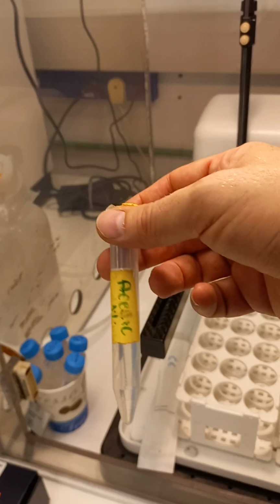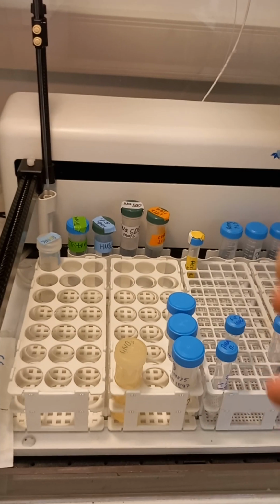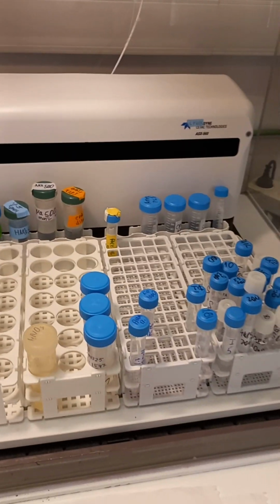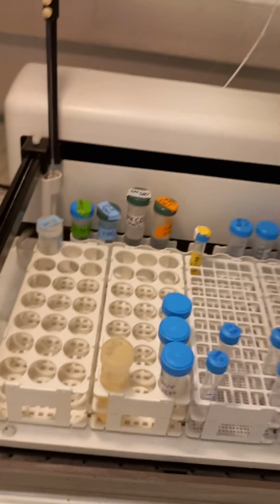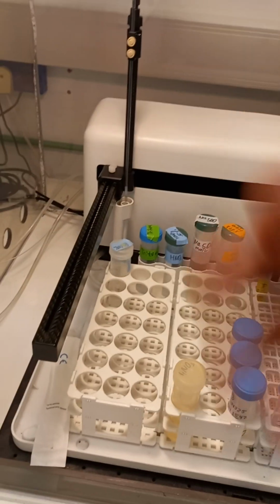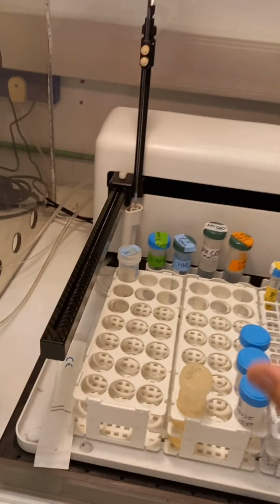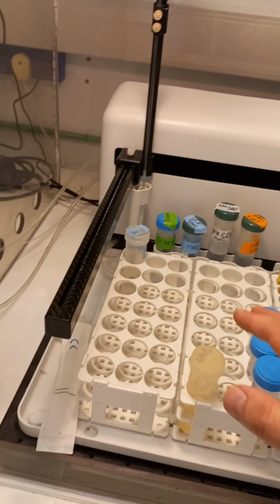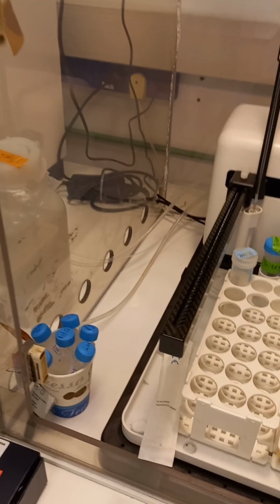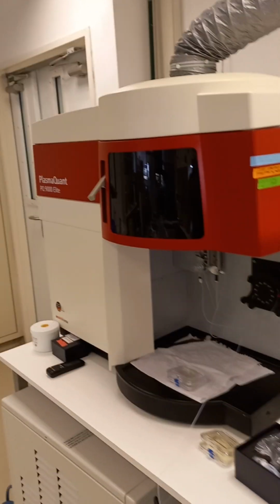Also, every day I use 1% of acetic acid. What acetic acid does, it may catch the cations of elements. Acetic acid is a well-known extractant of the elements from soil, for example. So I use this feature to wash the cations of different elements from my system. And of course, after all these strange and not so compatible with good ICP measurement practice solutions, I should wash them out by 1% of nitric acid, and then my blanks are getting much better. So this is more or less our ICP instrument.